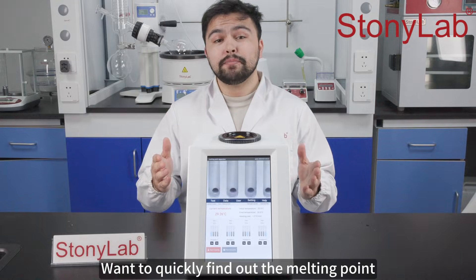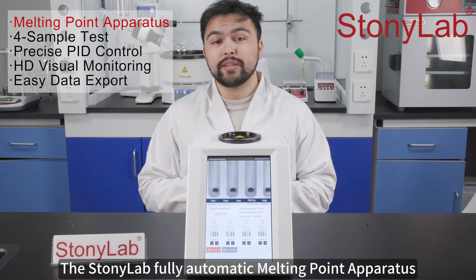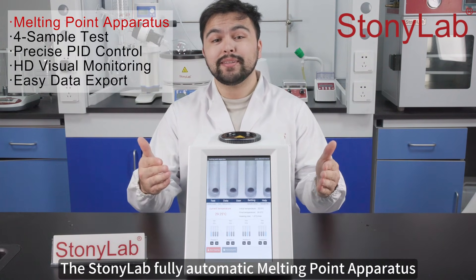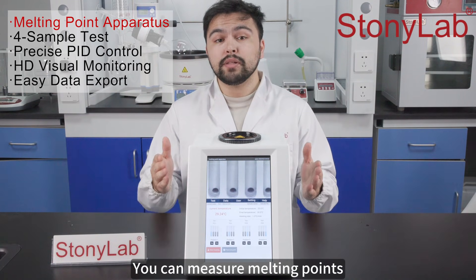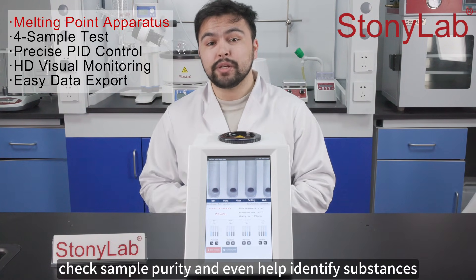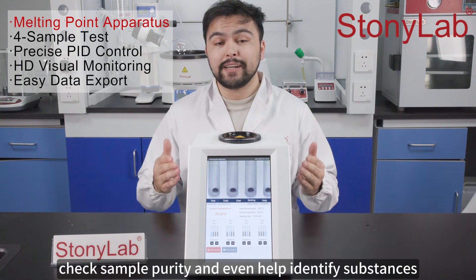Once you quickly find out the melting point of your samples, the StonyLab fully automatic melting point apparatus makes it easy. You can measure melting points, check sample purity, and even help identify substances.